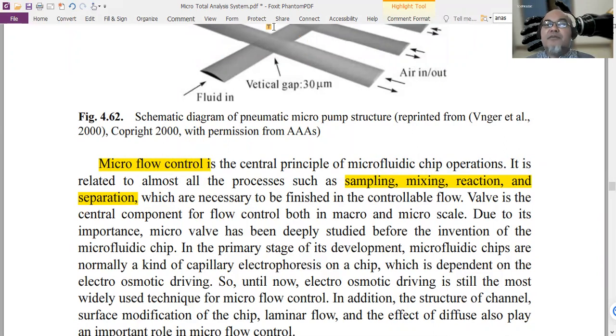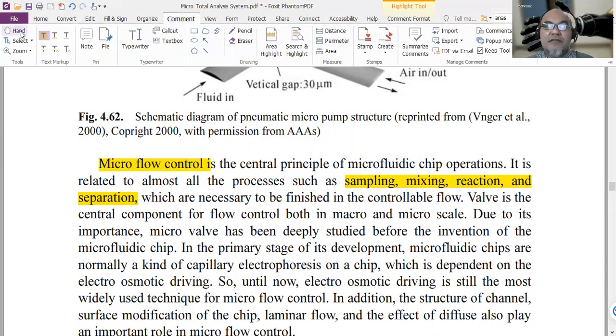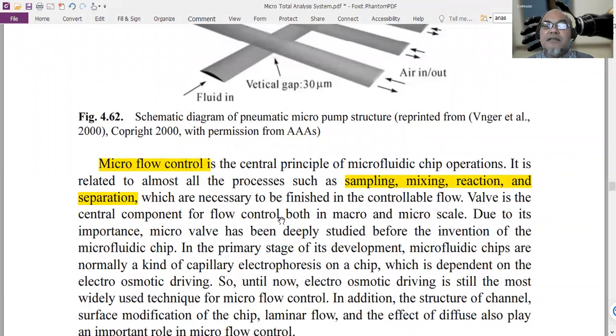In fabric-based or paper-based microfluidic devices, on the other hand, they do not require pumping because the flow occurs through capillary forces. While pumping is usually required when you have the microfluidic in a hollow channel device.